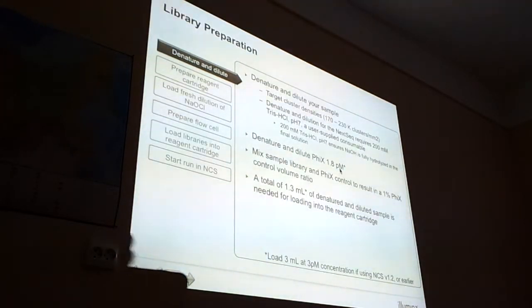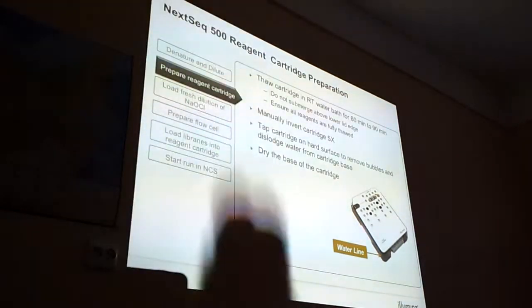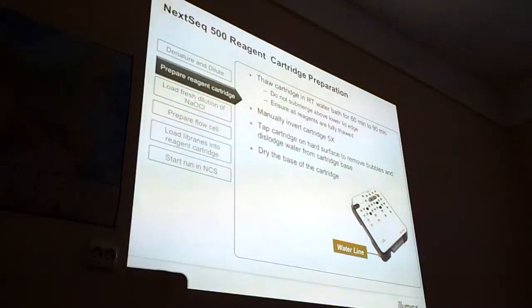So now you know what is written here in the start. This is now already the case. Okay, so here again, 60 to 90 minutes in the water bath. Be careful, don't put water here on the surface. If there is water, dry it. Shake it at minimum 5 times. And also put it on the table to remove the bubbles. It's the same as for MiSeq.